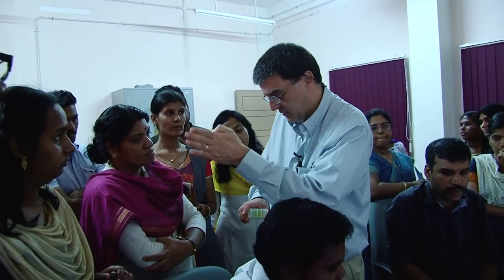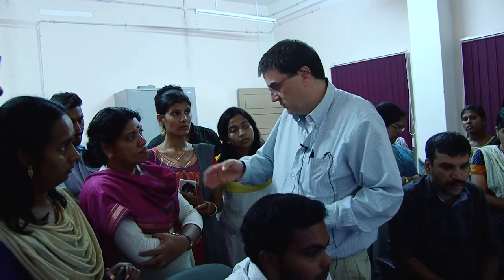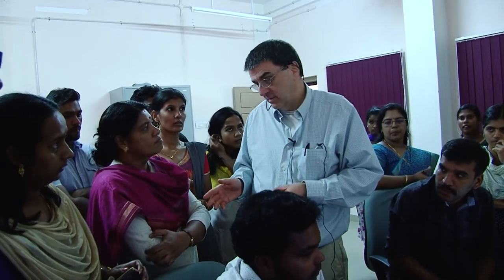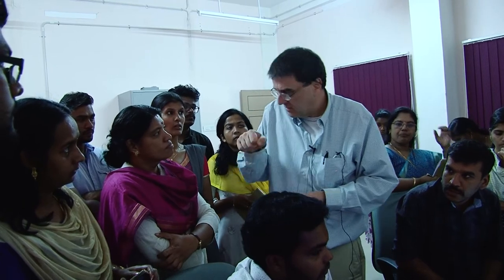Usually we hold the blues for DAPI and that Hoechst dye. And then we use the reds and the greens for more experiments. Not good for live cells. You always try to stay out of that UV if you can, because the energy is just pounding it.